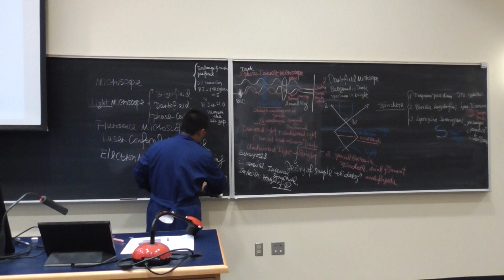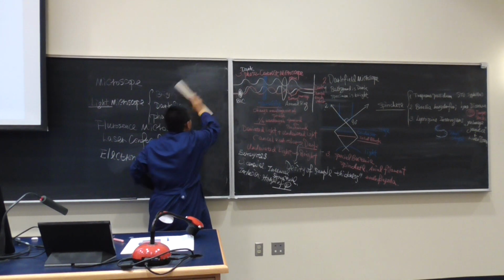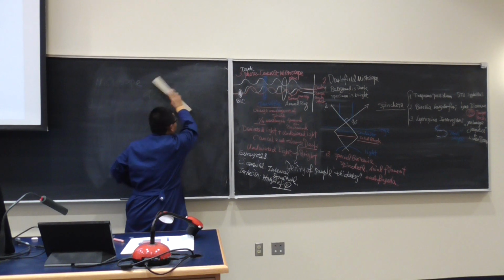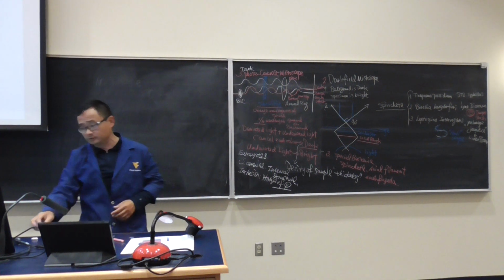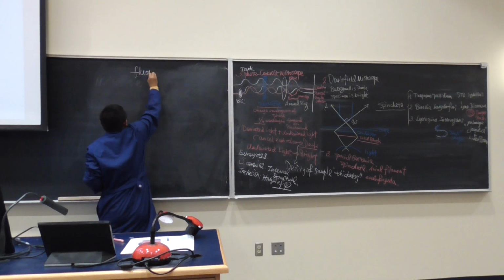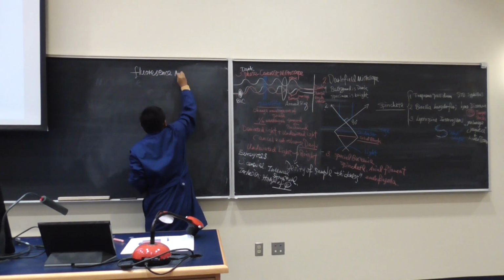I want to introduce it briefly because this is a transition stage to the laser confocal microscope. It's a similar pattern, but a different energy resource. Fluorescence microscope.